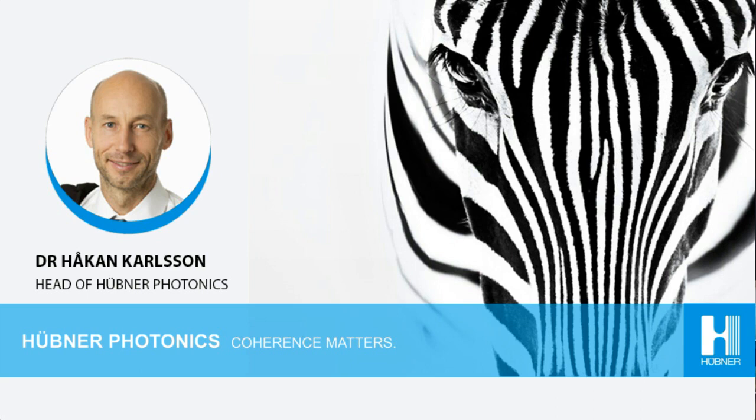In one of your slides, you mentioned the importance of the polarization extinction ratio. Why is the polarization important? Yes, that's true. Normally, I would say that the information on the chemical composition of the material that is studied with Raman spectroscopy does not require polarized light. You can get the information about the chemical composition with any kind of polarized light.